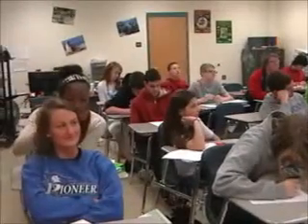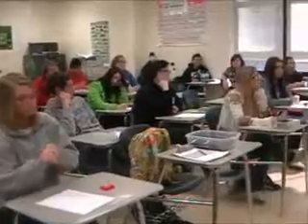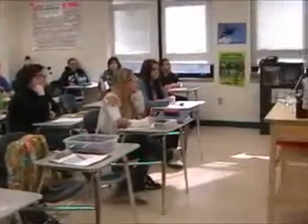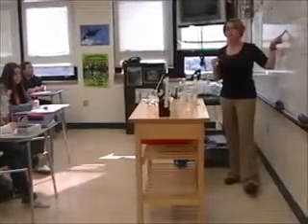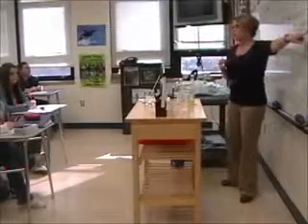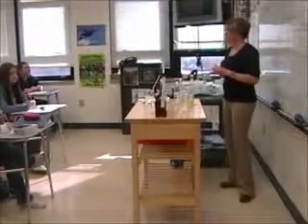So let's make a prediction about when we reduce our concentration. So this concentration is actually half of our control. So I just reduce the concentration. We are at 25% with the control. I reduce it down to half. So let's try that one. Who would like to make a prediction?